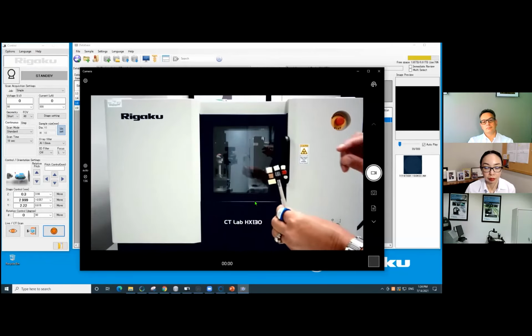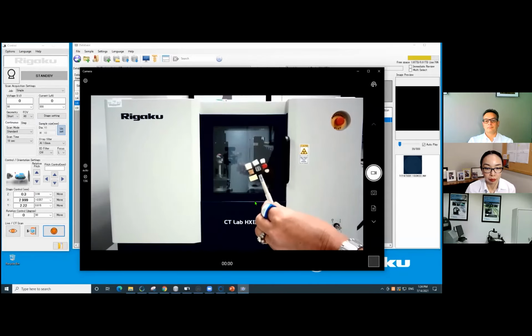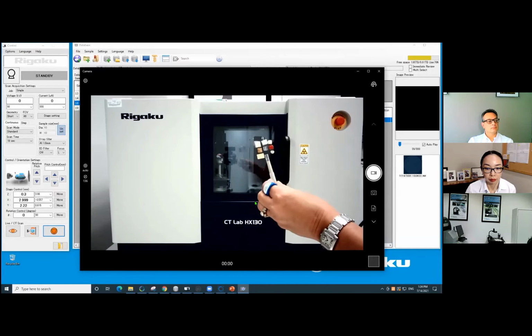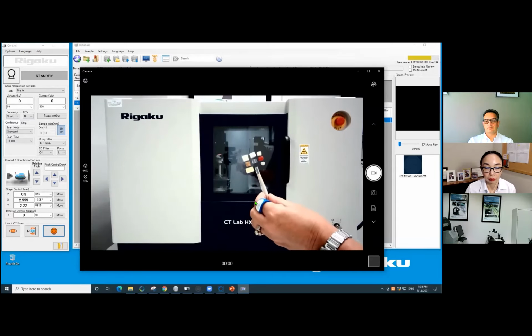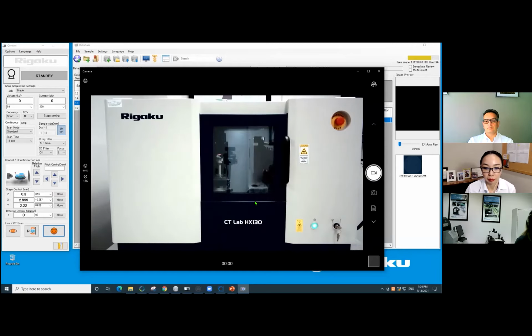And in this case, I've tried to make them all the same thickness. And basically we want to ask in this case, which one absorbs the most? So it's a very good idea for you to understand the mounting material you use and its absorption characteristics. So that leads us into our next poll.